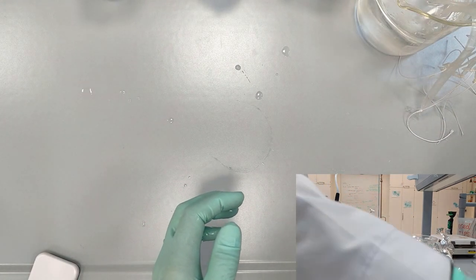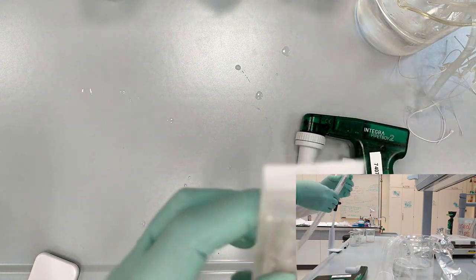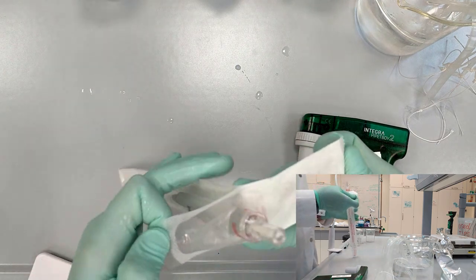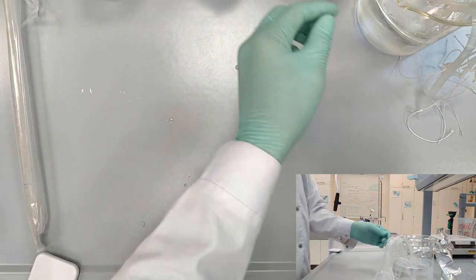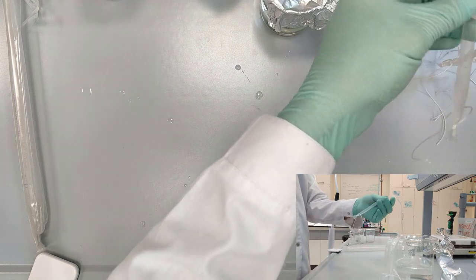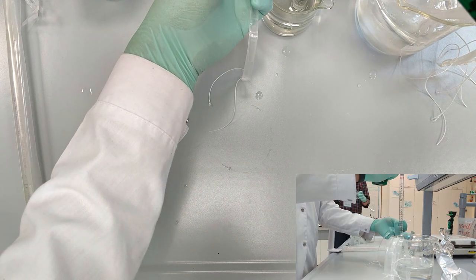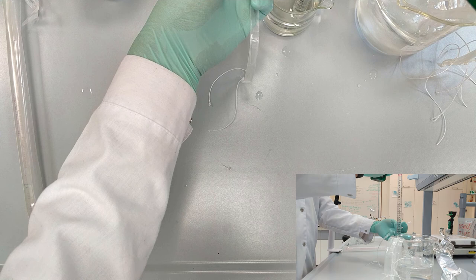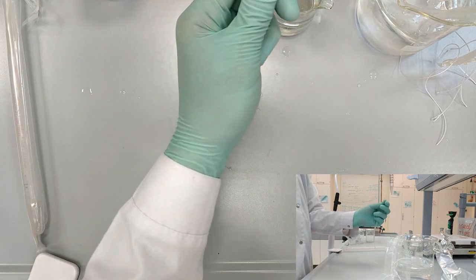So we take the pipette gun, place the pipette and transfer the solution into the dialysis tube. Make sure that you prepared the beakers where you are going to put these dialysis tubes beforehand.